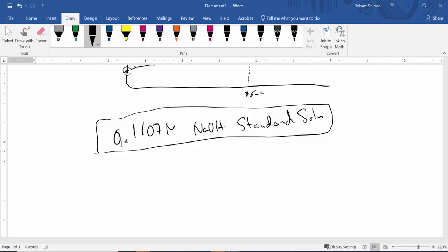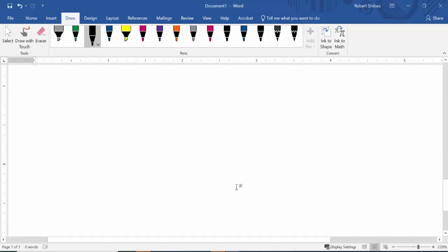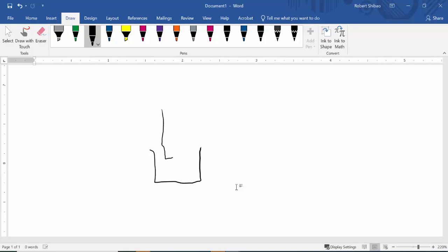All right, now when we do the pH titration, what we're going to do is we're going to use a beaker. Normally we don't like to use beakers for titrations because splattering is much easier in a beaker. This could splatter out and we'll lose it, whereas in an Erlenmeyer we're a lot safer from splattering. And so what we're going to do is dissolve our unknown acid in a minimum of water here, like this. And then we're going to put a magnetic bar in here. This is a Teflon coated magnet. It's called a magnetic stir bar.